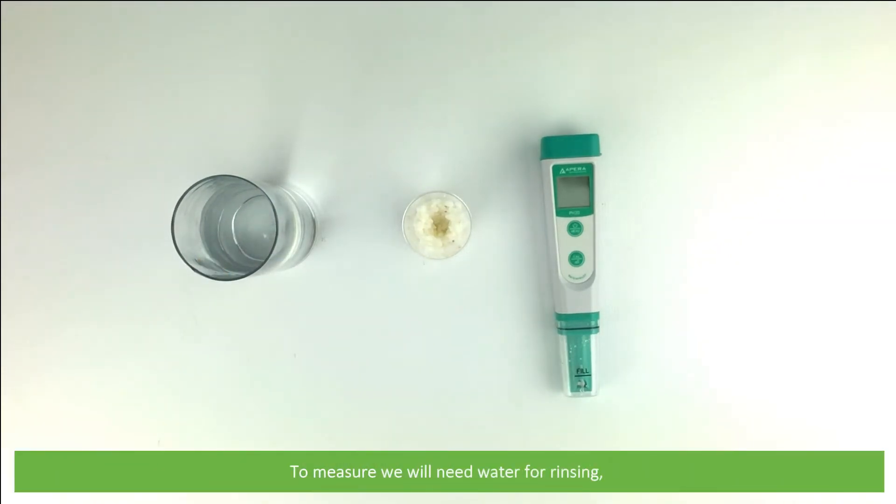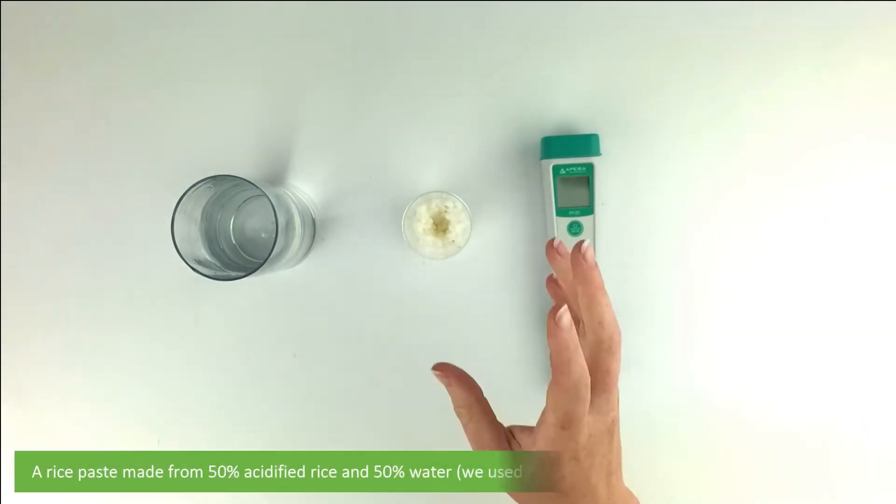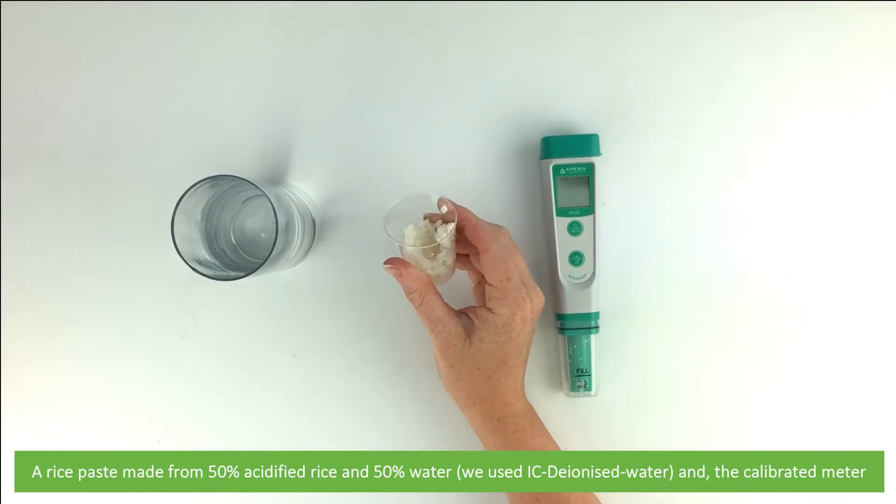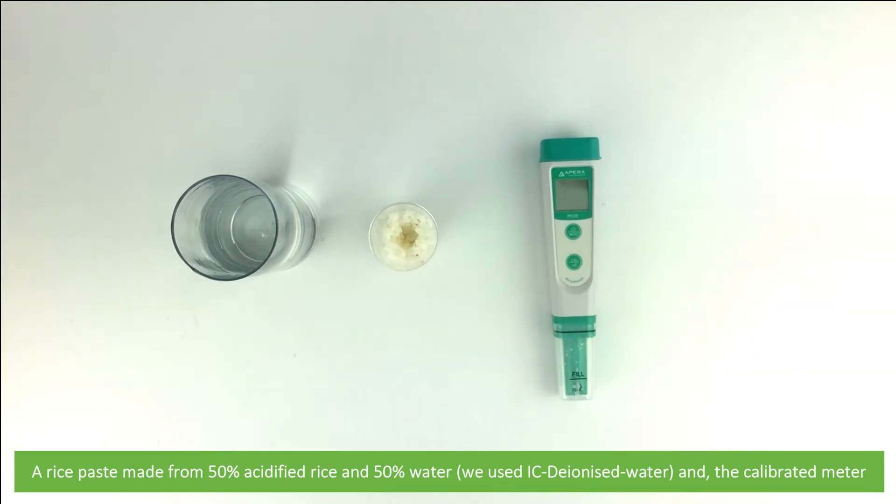To measure, we'll need water for rinsing - we use deionized water. A rice paste made from 50% acidified rice and 50% water. We use deionized water and the calibrated meter.